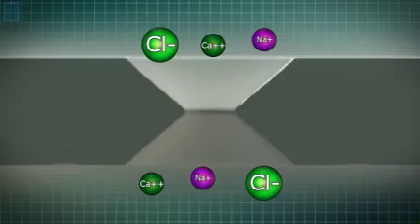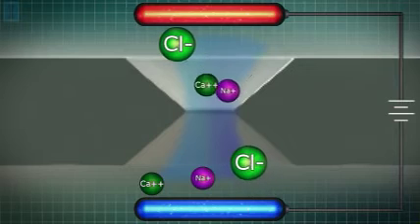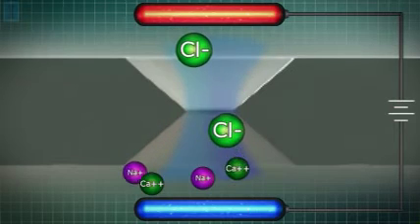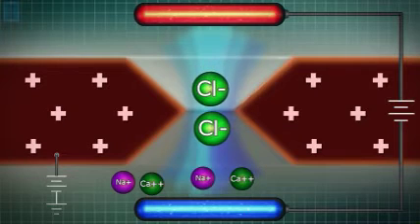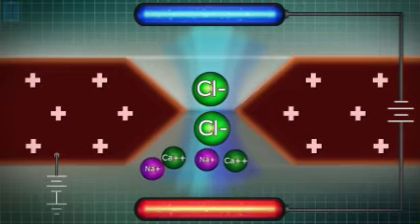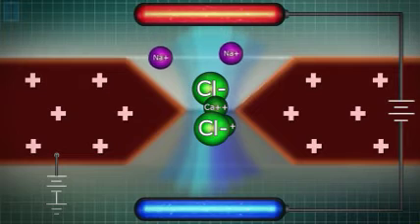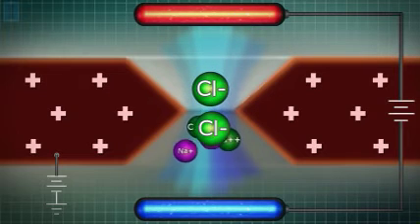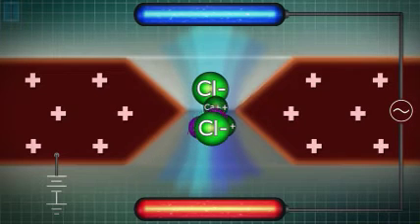In this view, we see an environment containing several ions. When a bias is applied, these ions drift predictably towards the plate with opposite bias. To enhance flexibility, we now introduce a bias to the membrane. This bias creates charge in the membrane and a resulting charge field in the membrane pore. With the addition of charge to the membrane, the movement of the ions depends upon more than the charge of the ions. Their size becomes a factor as well. This enhanced flexibility is a tremendous improvement in designing specialized pores.